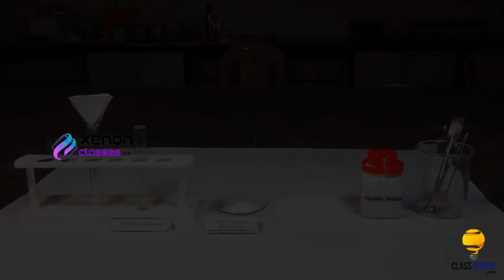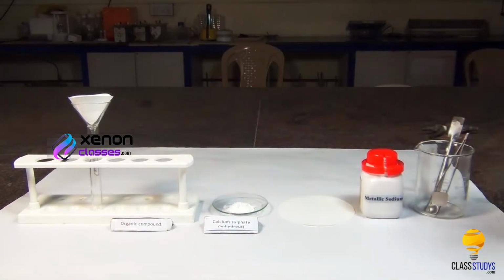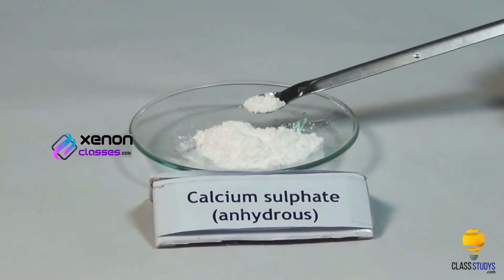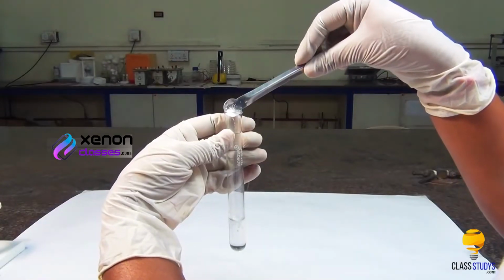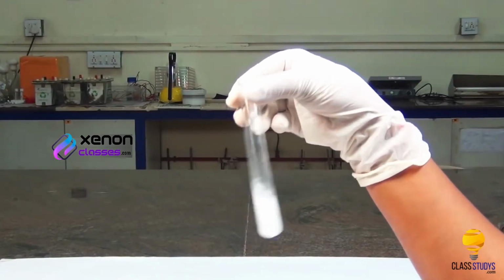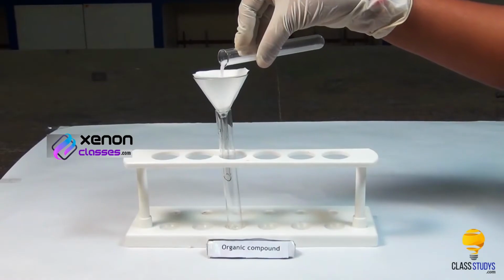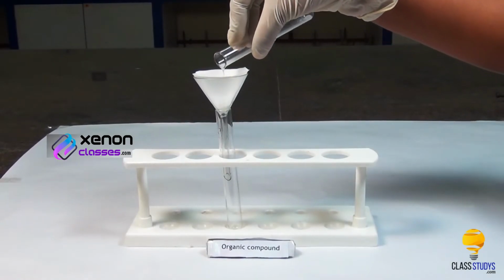Procedure: take a small quantity of organic compound in a test tube. To this, add a small quantity of anhydrous calcium sulfate using a spatula. Shake the test tube well to remove any water content in the organic compound. Filter the contents into another clean, dry test tube.